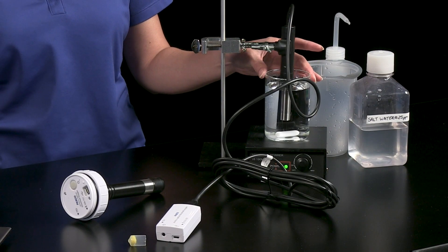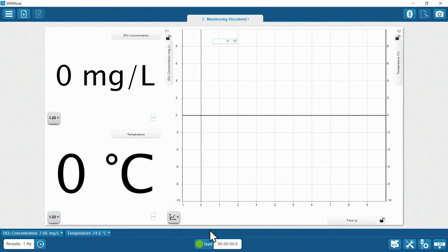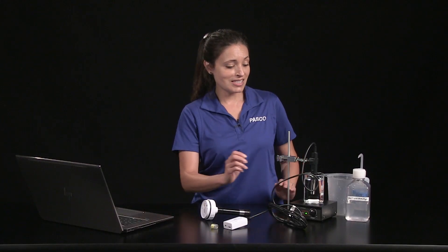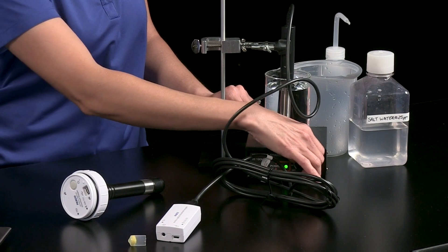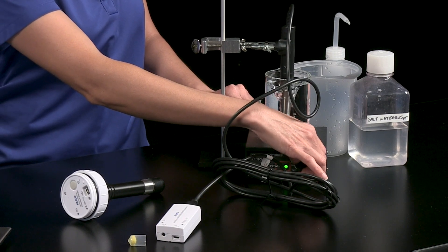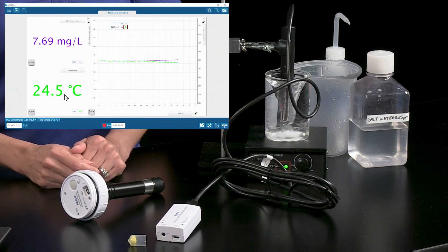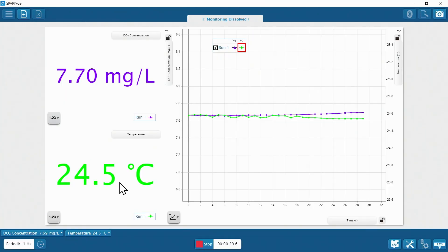Now let's do a quick water quality investigation and see how the dissolved oxygen concentration of this tap water sample at rest compares to the concentration while being stirred. At rest, the dissolved oxygen concentration is 7.66 milligrams per liter at a temperature of 24.6 degrees Celsius. Let's turn on the magnetic stirrer and see how adding turbulence affects water quality. As you can see, the dissolved oxygen concentration is increasing as more oxygen from the air is mixed into the sample.